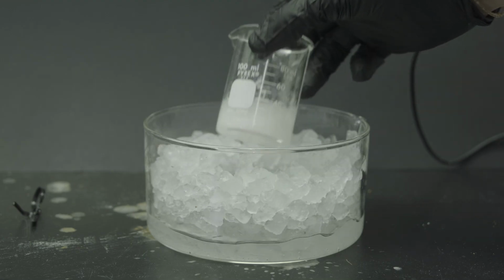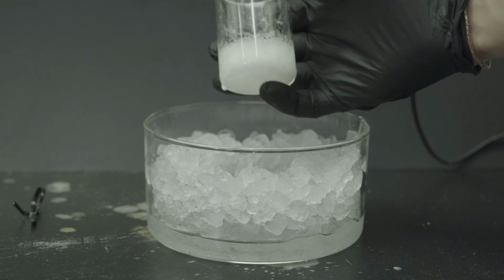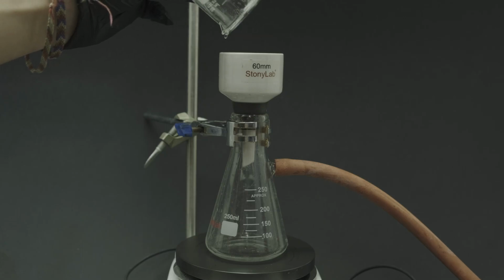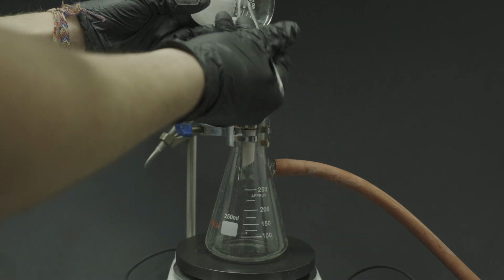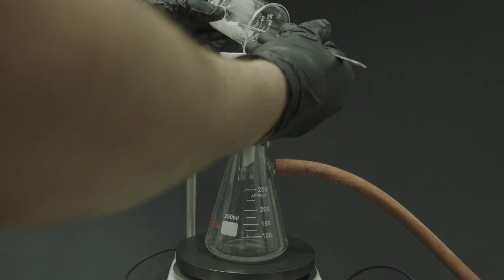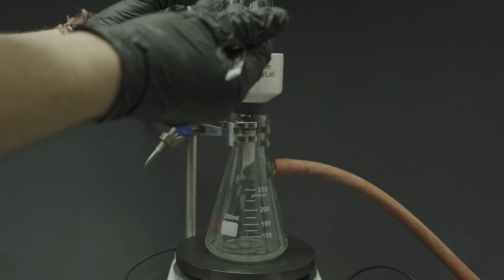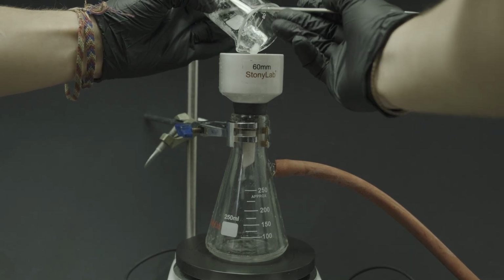Once I had felt the crystallization was done, I removed my beaker with all my crystals out of my ice bath, and as you can see, like I said before, it was almost completely crystal. There was almost no liquid left. I used a spatula to dig out all the crystals and dump them into the filter so that I could get them nice and dry. But I still knew that there was a chance this wasn't aspirin. I still needed to do my melting point check.